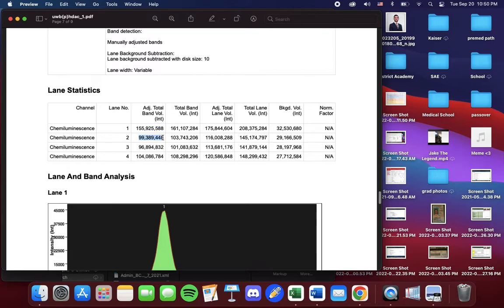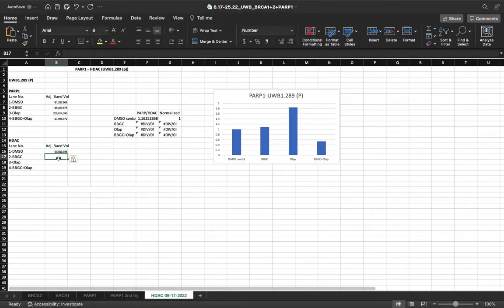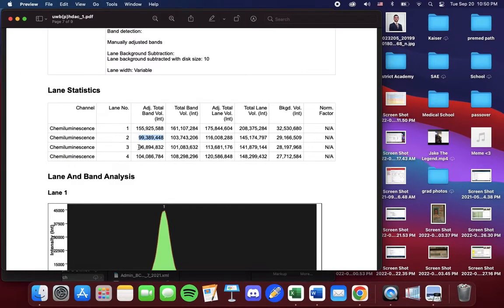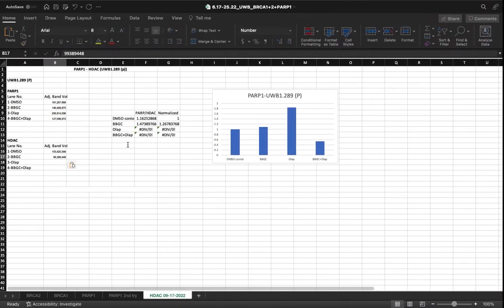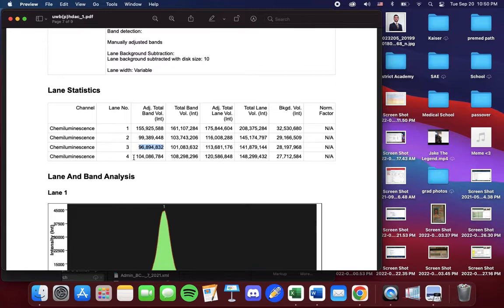Again, select, copy, and paste. Now, I'm making sure that I have record of which lane corresponds to which treatment. It's important that you match it up.